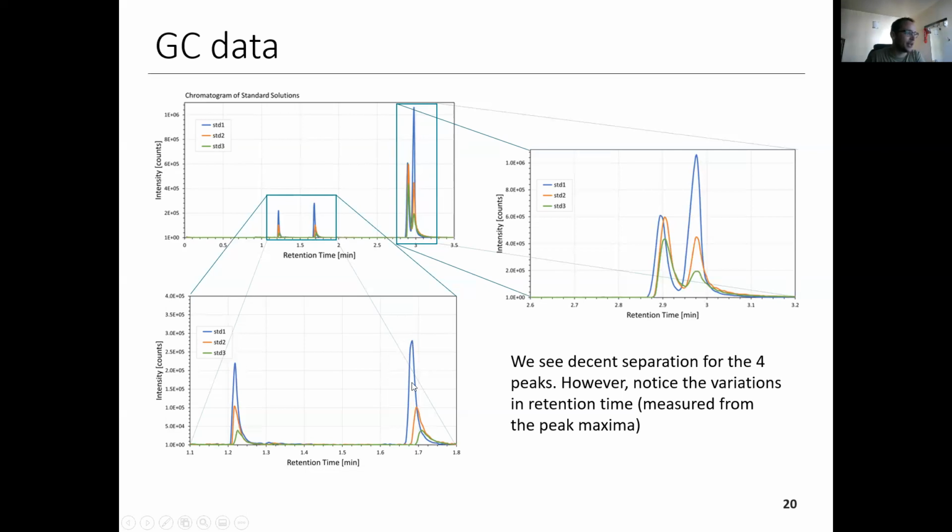You can see the retention times change a little bit. And this is because of the way the detector works, right? You can see that this one would grow up to here if it had more counts, but the retention times are only calculated based on the highest peak value. And so we actually want to normalize all of those as well before we construct our calibration curves.